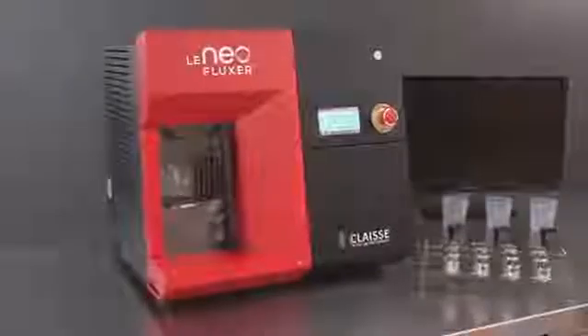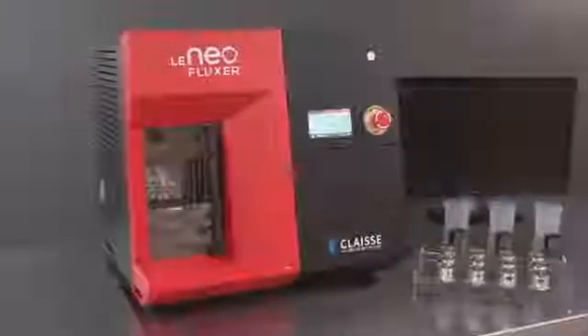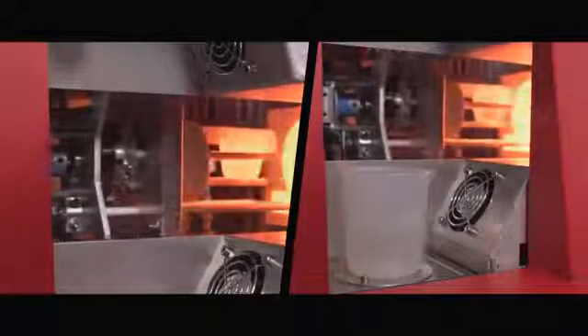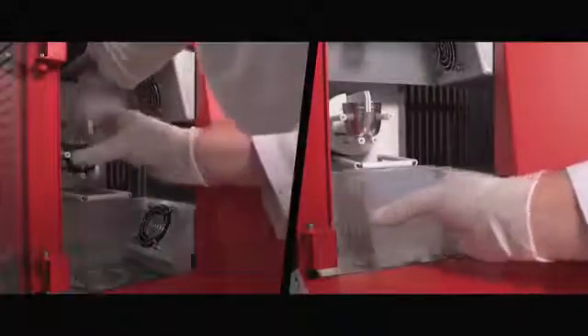Incredibly versatile, this instrument also prepares borate solutions and/or peroxide fusions for AA and ICP analysis. At the end of the fusion process, the molten mixture is poured into a beaker containing diluted acid. In case of a peroxide fusion, the operator can safely remove the cool zirconium crucible to dissolve its content.